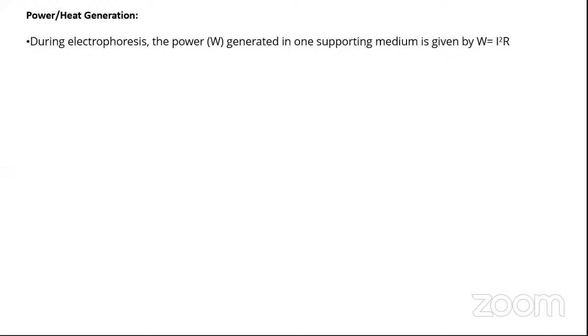Decrease in viscosity due to increase in temperature means electrophoretic mobility will also increase, right? So will you get a better separation? Is it a fair question to ask now, with the analogy that we have built up?